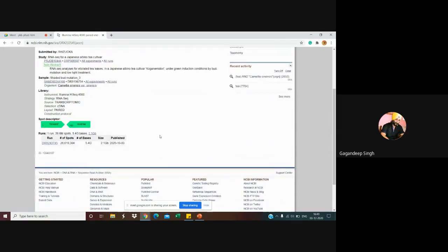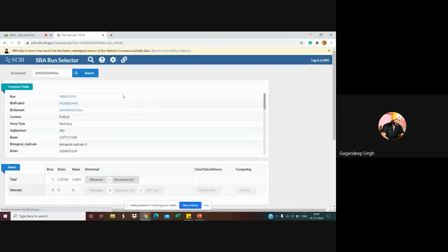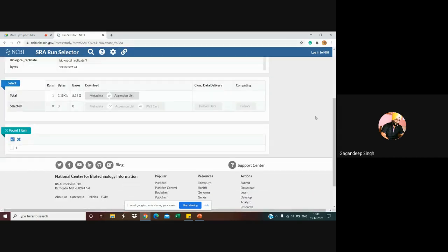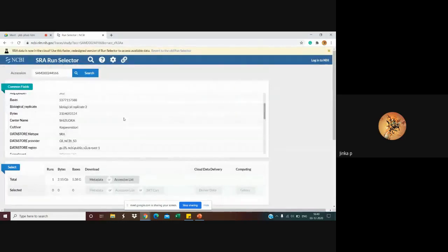Where is all runs? There is a sample. Here there is only one run.